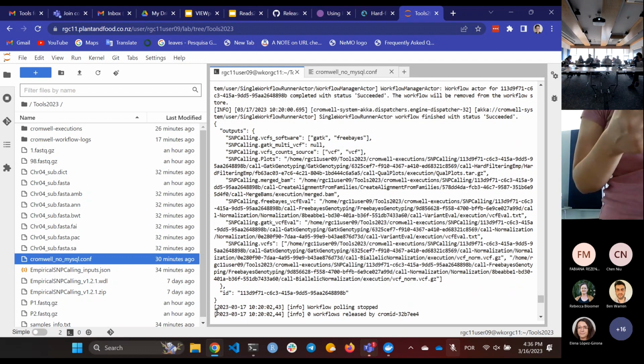If a single task fails in the workflow, you have all the intermediary files for the other tasks, but the workflow says that you failed. So probably one of the GATK parts, the HaplotypeCaller, is more memory consuming. And probably what happened is that we didn't have enough memory. So some of you have results, some of you don't.